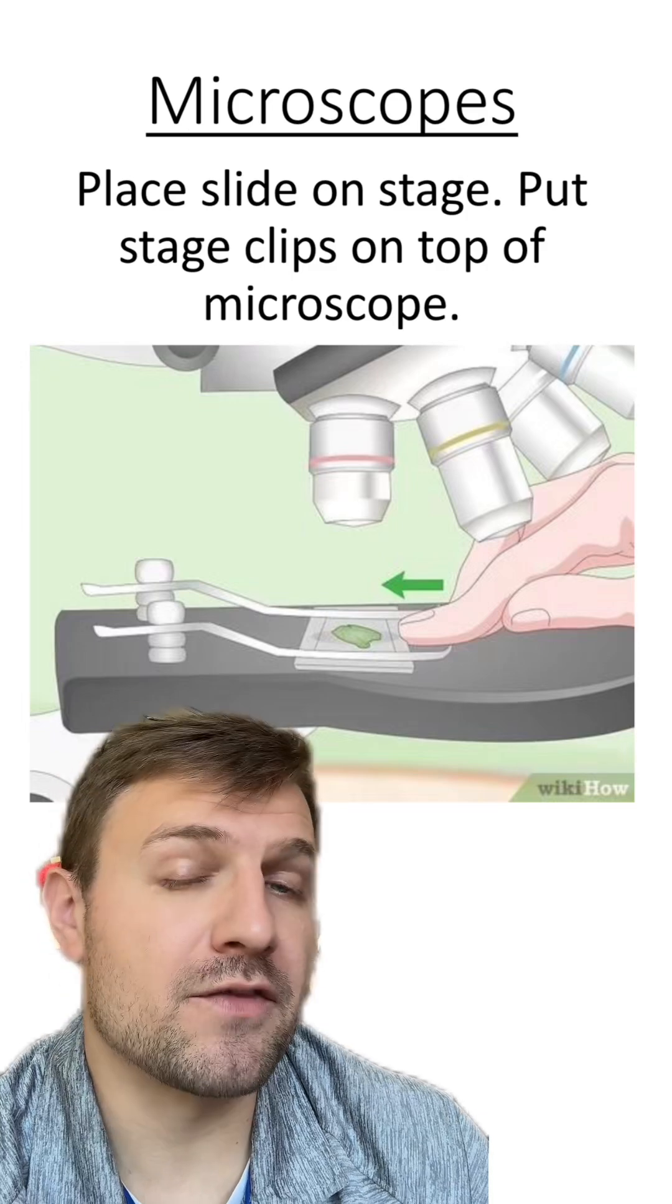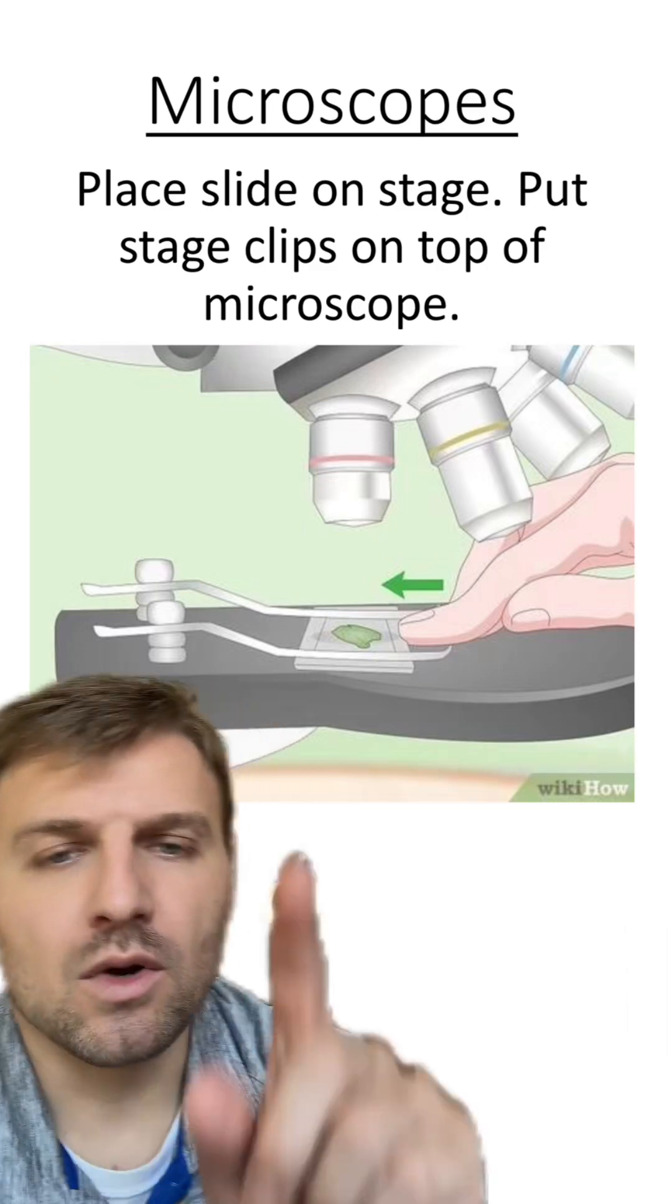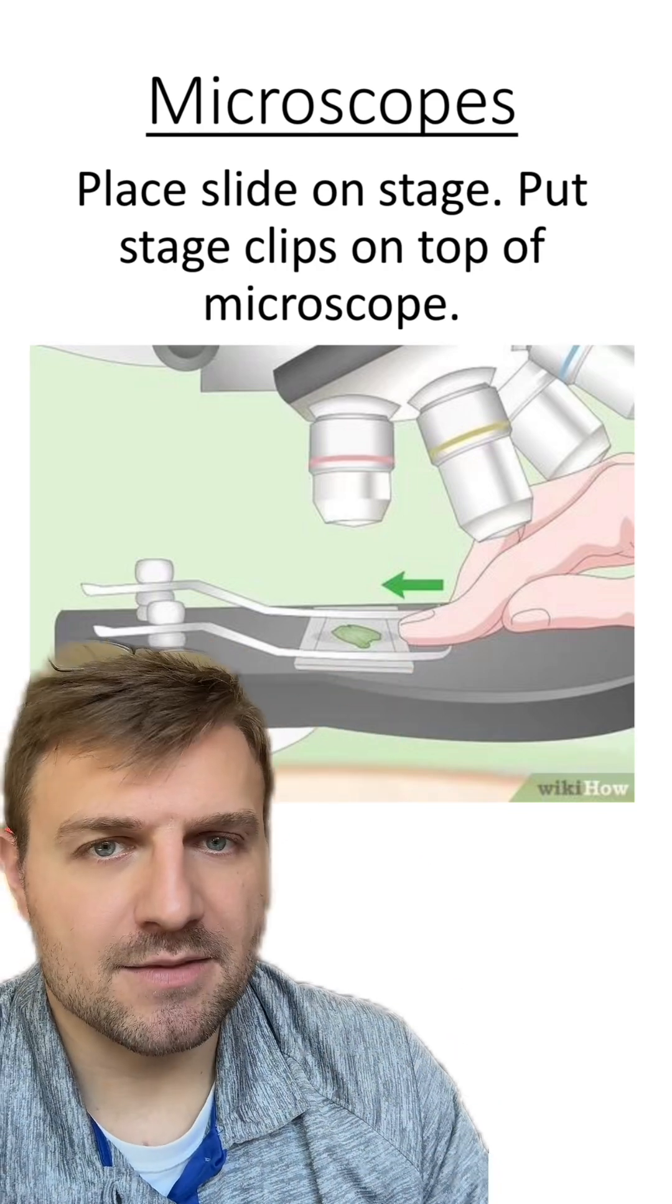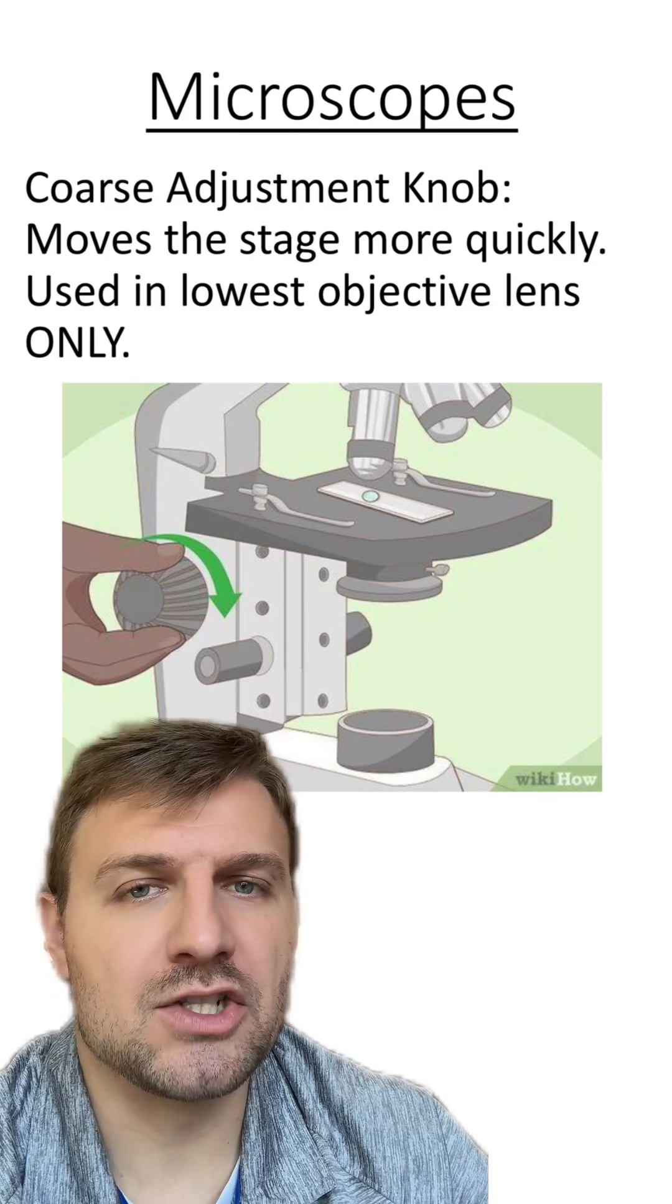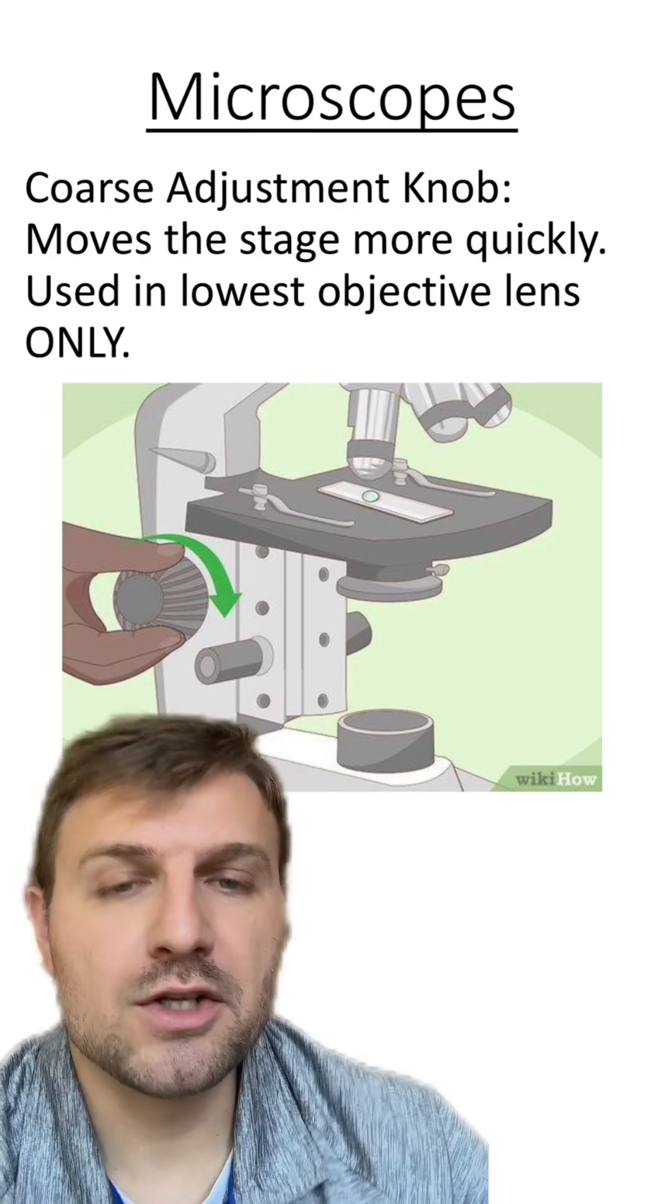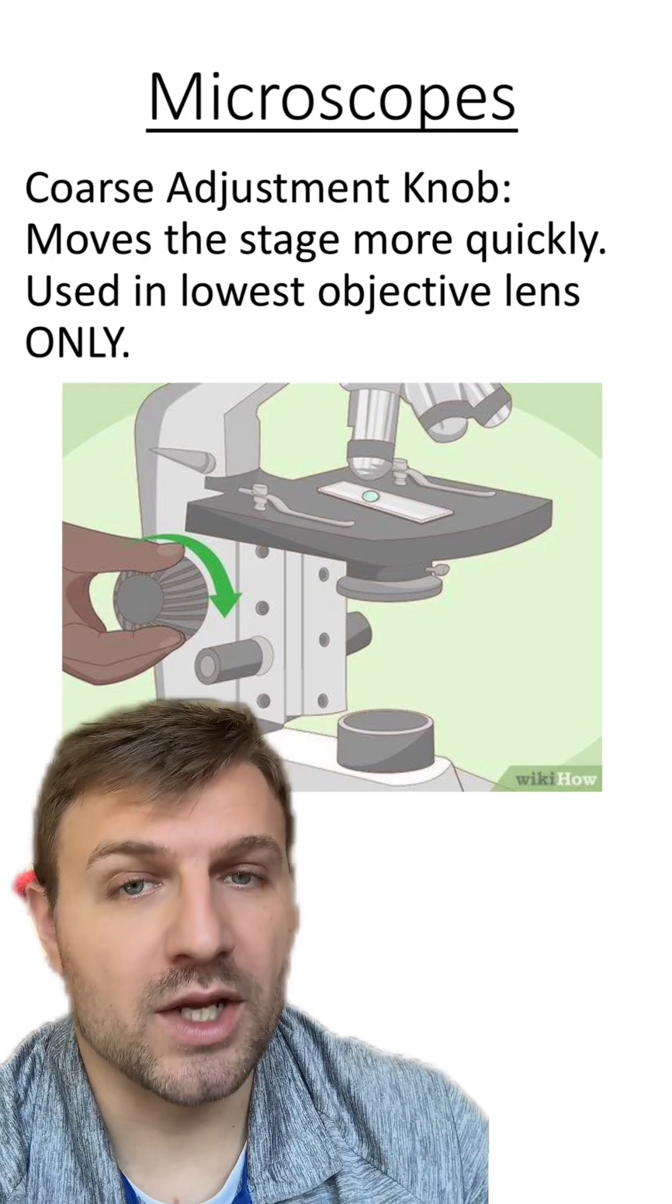Next, you're going to place the slide or whatever you're looking at on the stage. You also want to place these stage clips on top of the slide to keep it in place. At this point, you're going to use one of the adjustment knobs, specifically the larger one, the coarse adjustment knob. That's going to move the stage up and down more quickly.